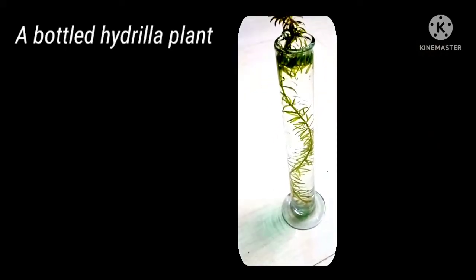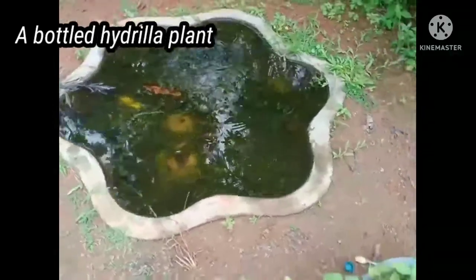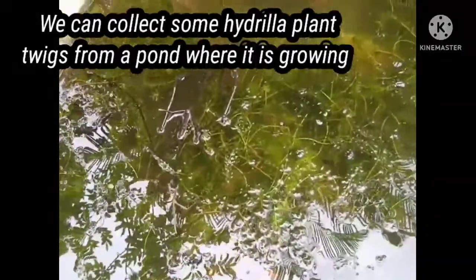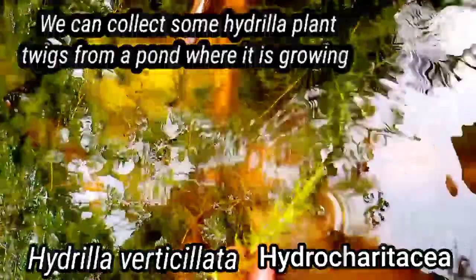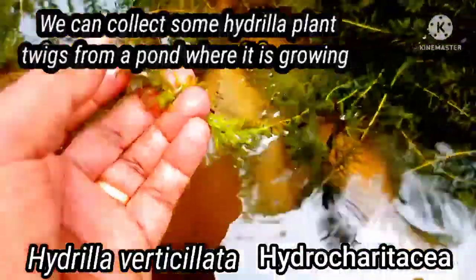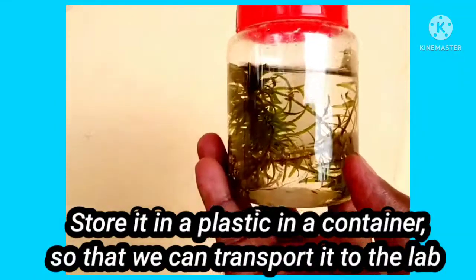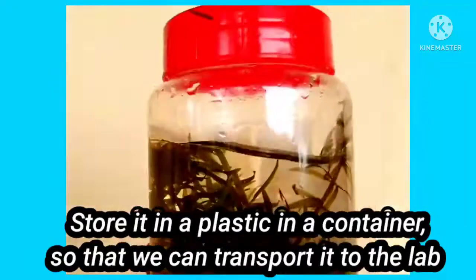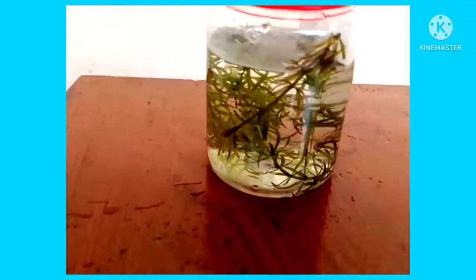Here you can see a Hydrilla plant kept in a bottle. The Hydrilla plant is found in water bodies such as rivers and ponds, and can be collected from a pond. Hydrilla is classified in the family Hydrocharitaceae, and Hydrilla verticillata is the species used. It is an aquatic water plant.